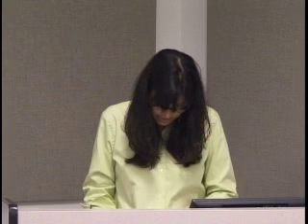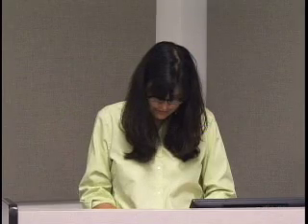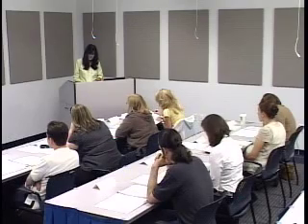And okay, so we'll just go over day 2. They're going to be running those samples on the CE while we continue our lectures. And then you'll be back in the lab to see the fluorescence slides that you've prepared today. We'll be running some new software and some advanced operations. You'll maybe get on the instrument a little bit and cut, but we're not actually analyzing these samples. And then toward the end of the day, you'll see your data, and hopefully it'll all work, knock on wood, and we'll go over that data.